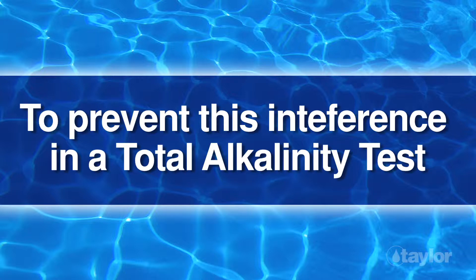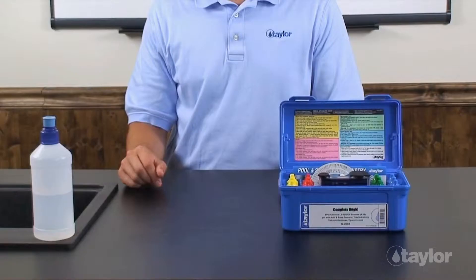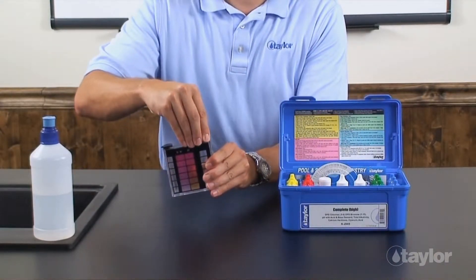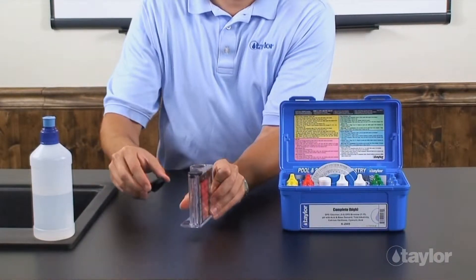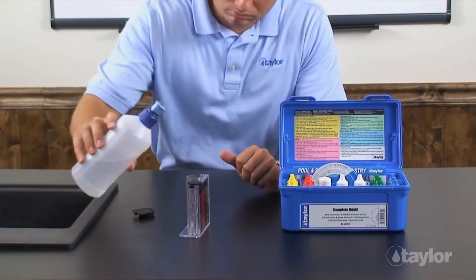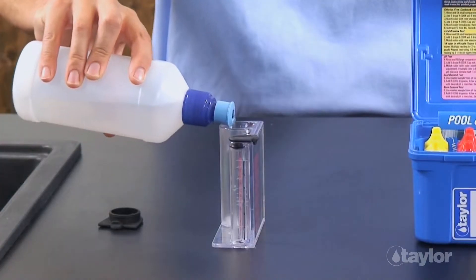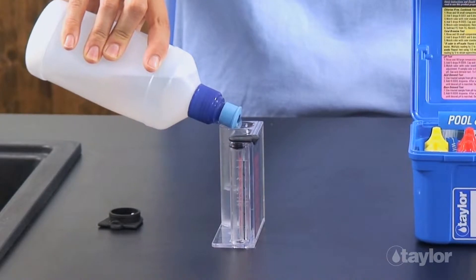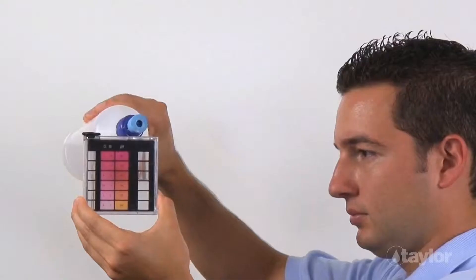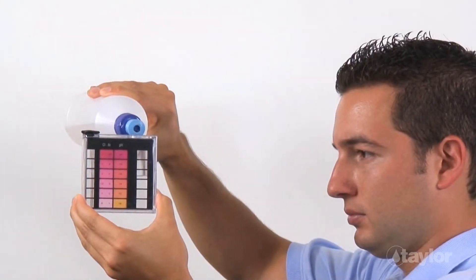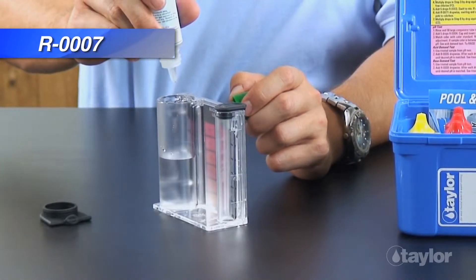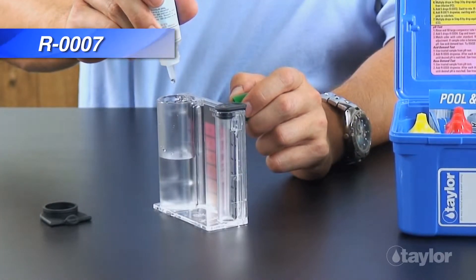To prevent this interference in a total alkalinity test, retest adding one additional drop of reagent 7 in step 2 for a total of 3 drops of thiosulfate. Rinse and fill the large comparator tube to the 25 ml mark with the water to be tested. Add 3 drops of reagent 7 to neutralize the sanitizer residual.